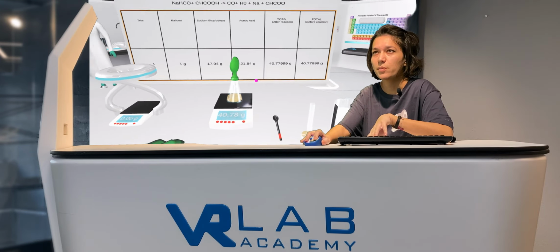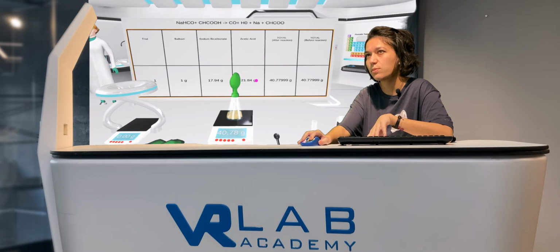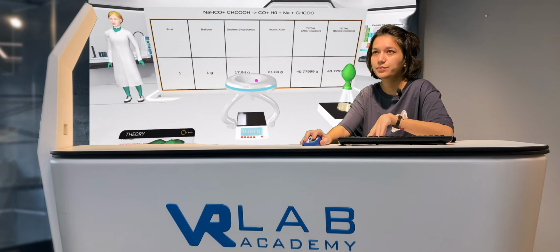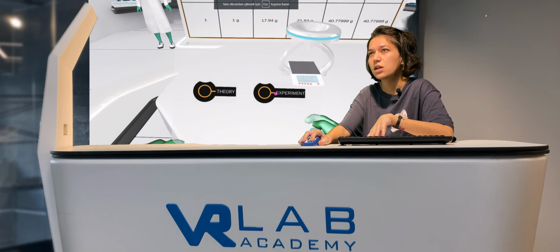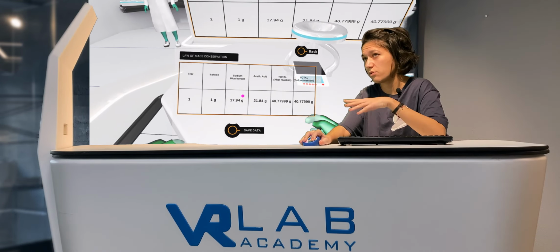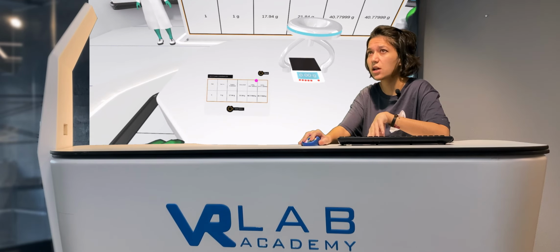The experiment will be performed, and the values that we weighed before are going to be noted on the board. I click on the digital tablet. I go back and see that the information that I have previously found out is written on the digital tablet. I right click and leave the digital tablet on the table.